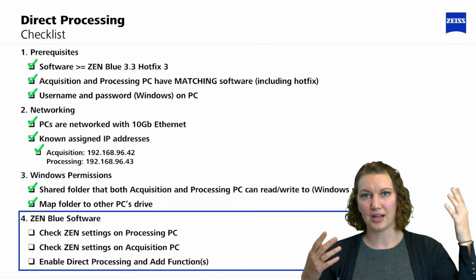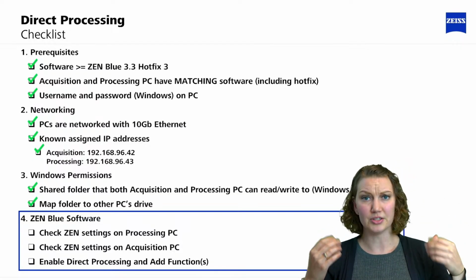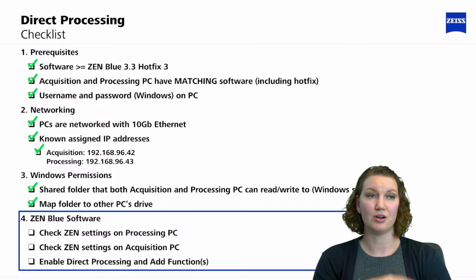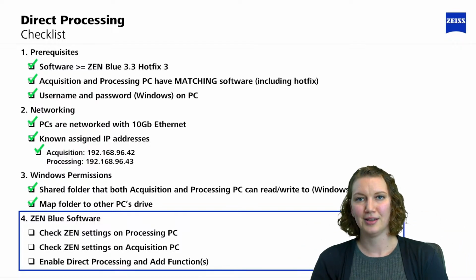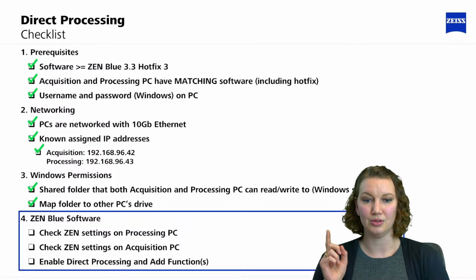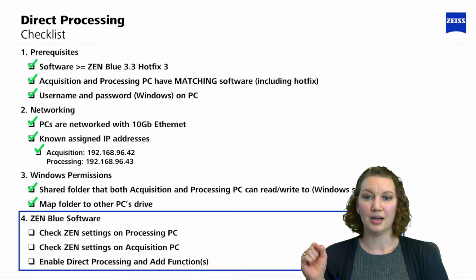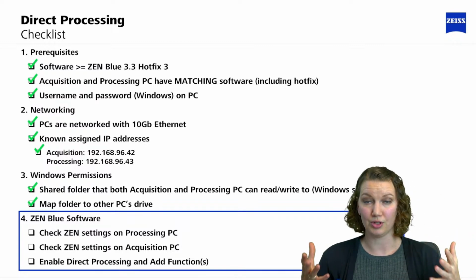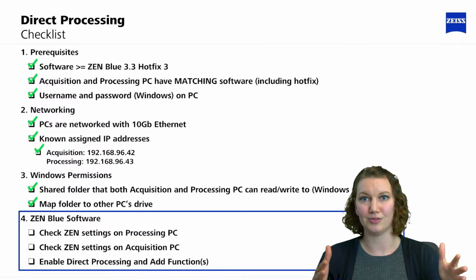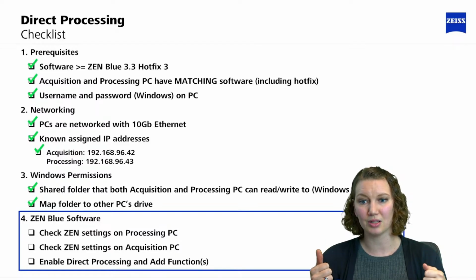So our portal, which I always highlight at the end as well, is a resource for you as our Zeiss customers where you can have all this digital training content. If you like to teach yourself and spend time going through videos, this should be added soon if it hasn't been added already. But you basically just have this checklist of, if you want to use this, this is useful for you to maximize efficiency on your instrument and get to your results more quickly.